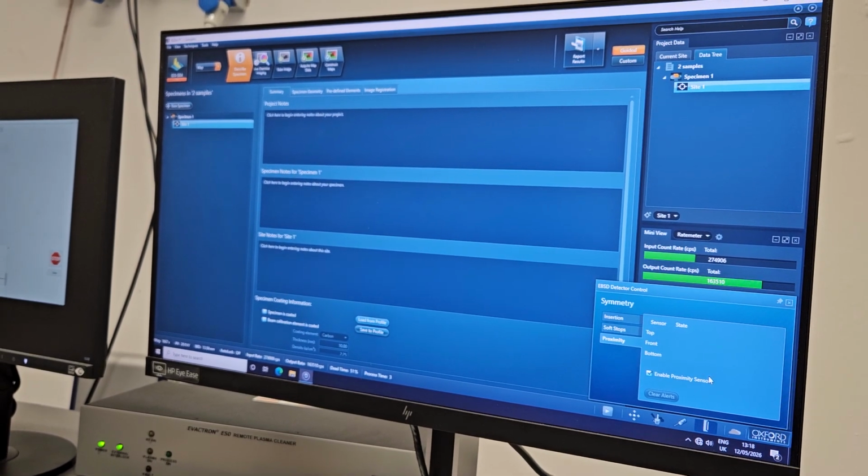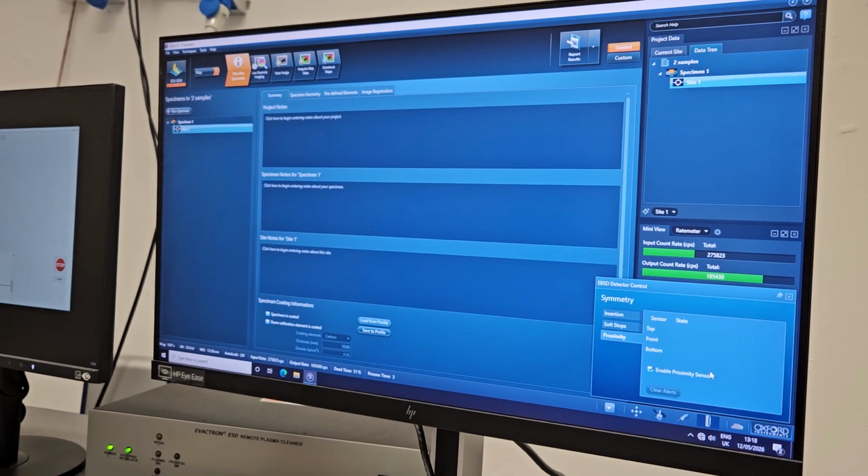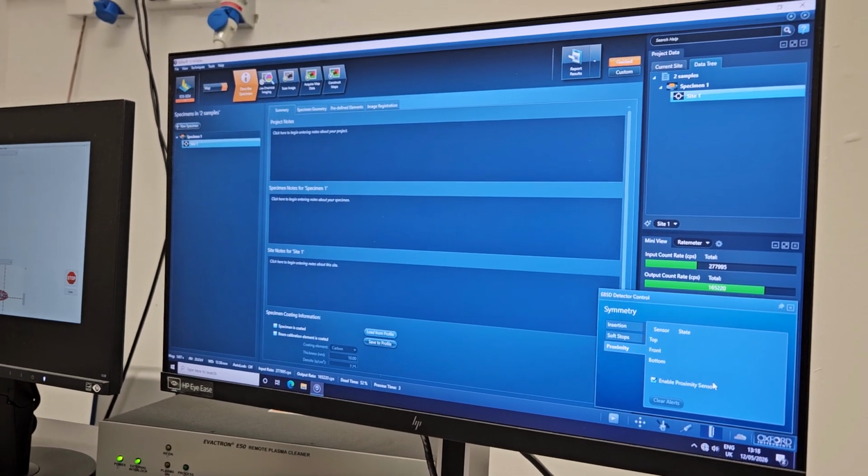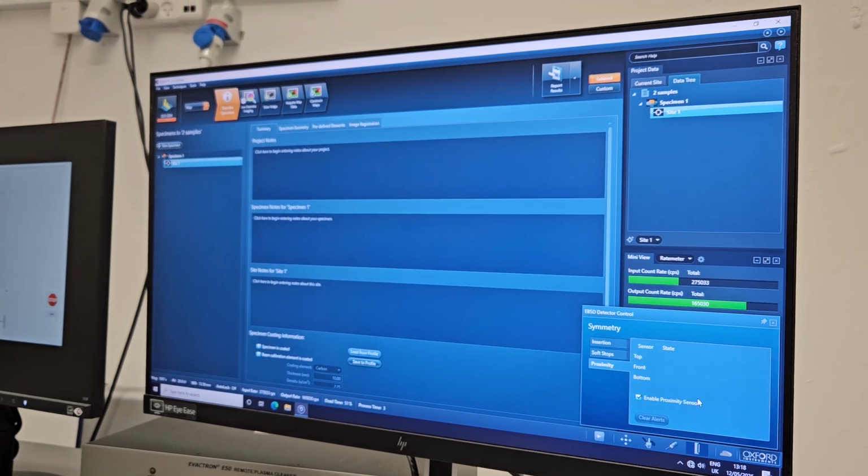And then the sensor doesn't work. So it should always be on when you insert. When you retract, it's not dangerous, it doesn't have to be on.